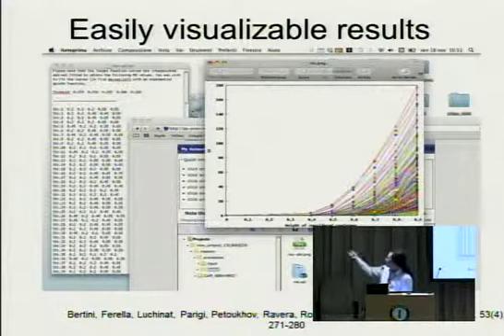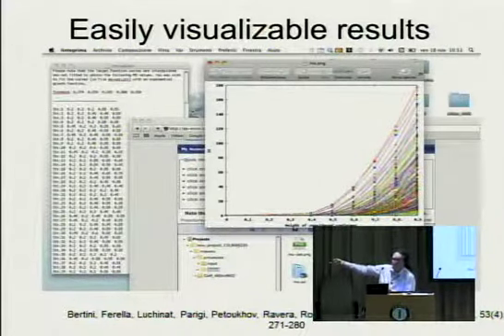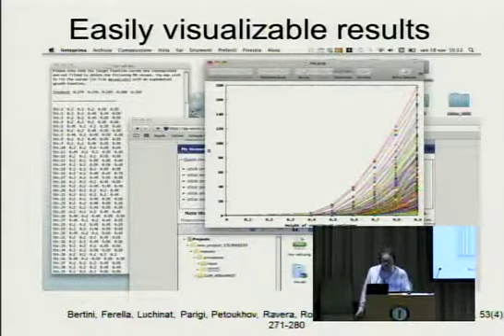So you can rescale the various contributions as we were discussing just now. And because you see at the beginning, more or less all the structures, when the weight of the conformer is very, very low, you can always find an ensemble that will be happy.